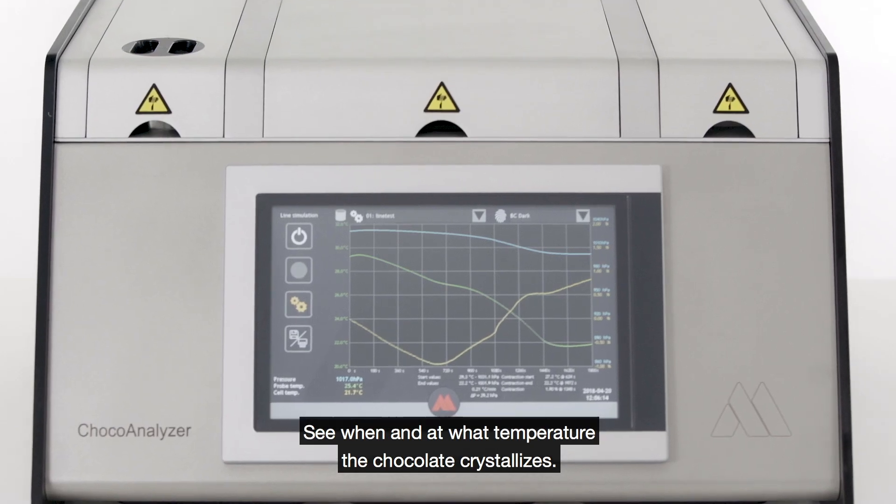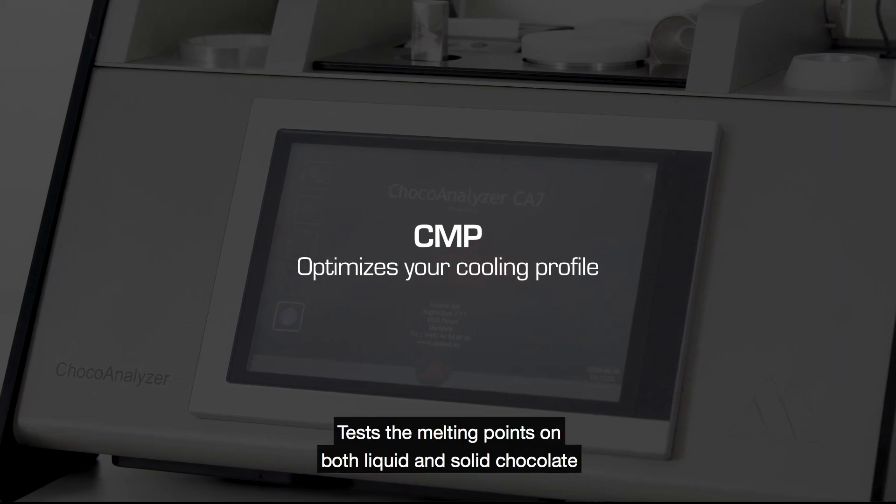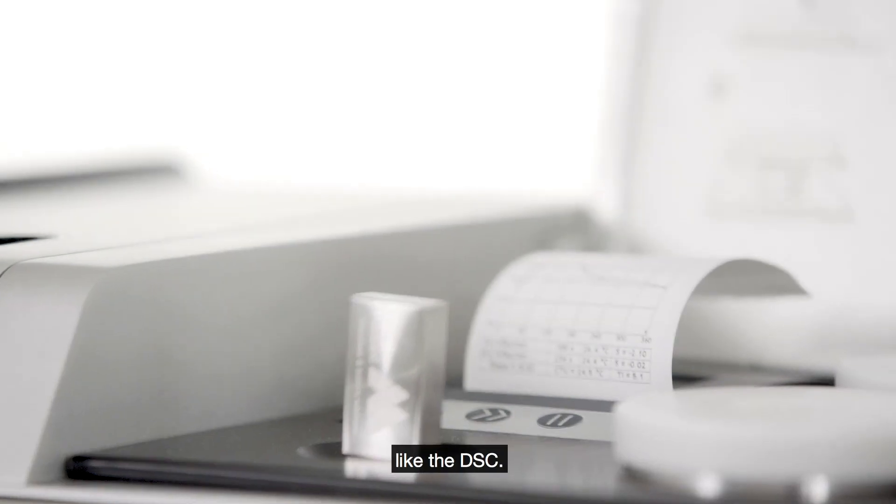See when and at what temperature the chocolate crystallizes. Crystal melting points, CMP — test the melting points on both liquid and solid chocolate, like the DSC.